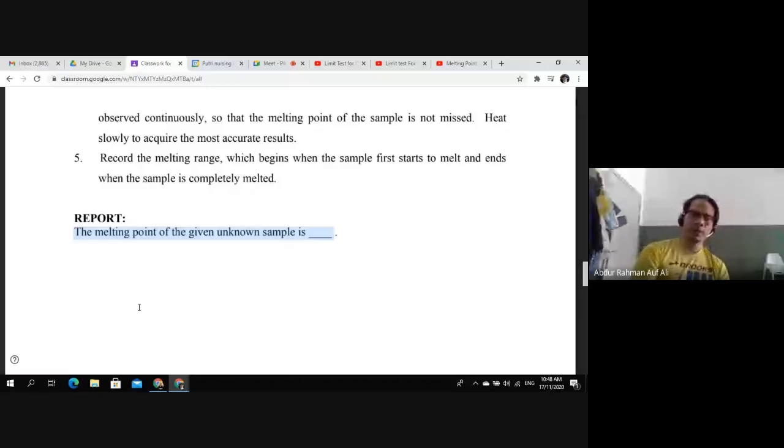The melting point of the unknown sample. So kalau multiple sample juga selalunya 3. Saya akan bagi Panadol tablet, saya akan bagi like other substance, other chemical, powder chemical yang ada dalam store. And satu lagi saya akan bagi like garam ataupun gula, just untuk kamu tengok perbezaan. Ya, so kamu beritahu lah unknown sample A berapa dia punya melting point, unknown sample B berapa dia punya melting point.